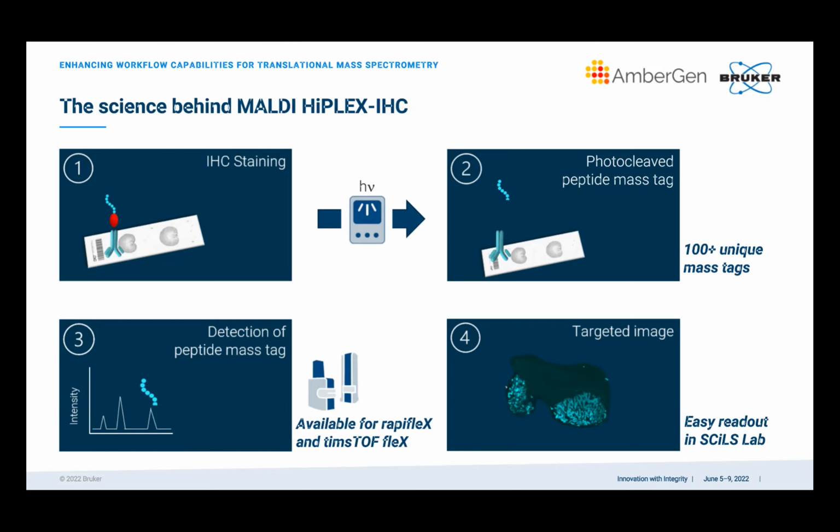Technical variability is minimal if the sample handling and the analysis is carefully accounted for. I mean, CVs of less than 2% variability from batch to batch, but drilling down on population level variability, we don't have enough samples to run nationwide to address that question. There are 2 schools of thought in doing single cell proteomics.